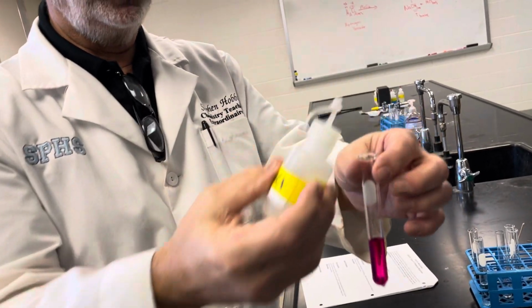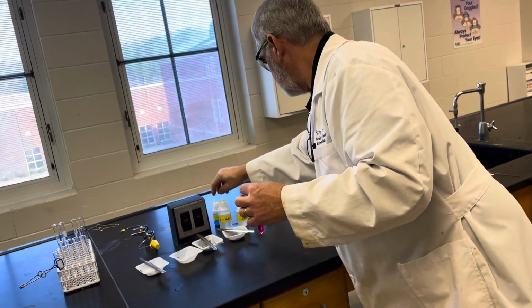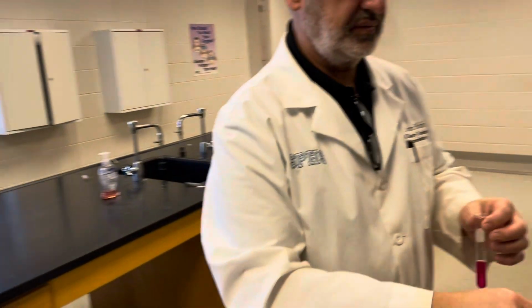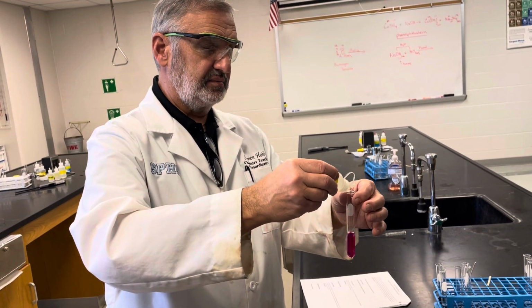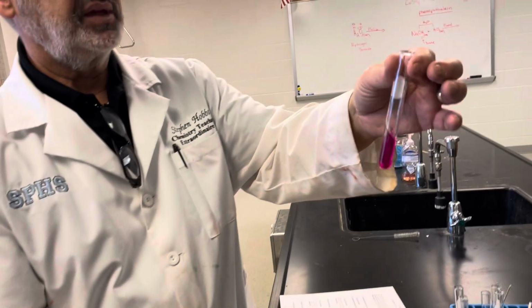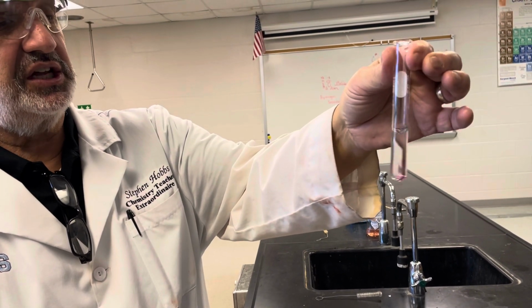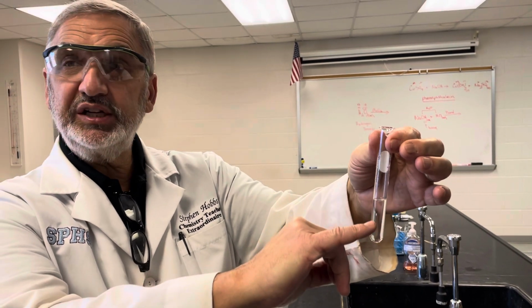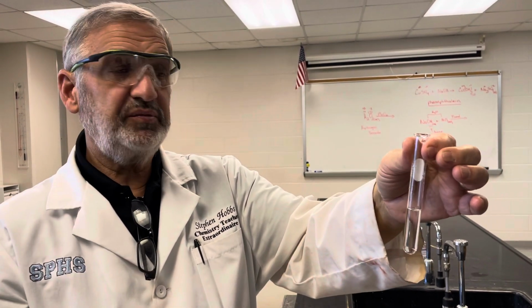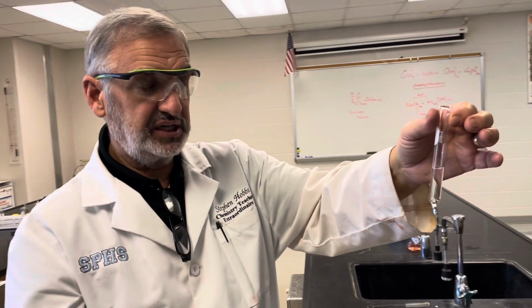Oh, crud. None of these squirt bottles want to work very well. We got to fix all those. I can add some HCl, and if I add just enough, I can make the magenta color go away, and that tells me now I have more H plus. So if there's more OH minuses present, then I have magenta color. If there's more H pluses present, then I end up having colorless.